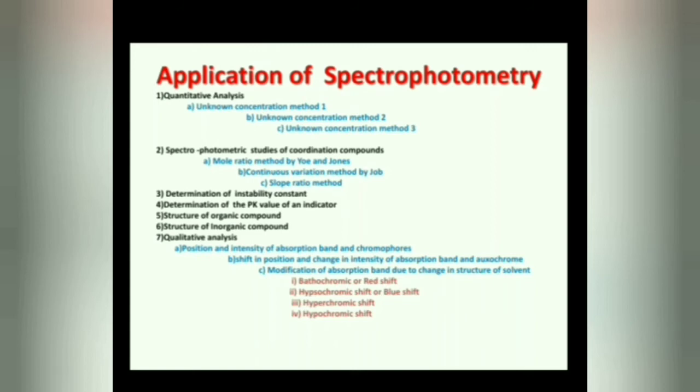The pK and hence the dissociation constant of an acid-base indicator can be determined spectrophotometrically. Here, the acid-base indicator methyl red is used to illustrate the method; the acidic HMR and basic MR minus forms of methyl red are considered here. Okay, then determination of pK involves some steps.